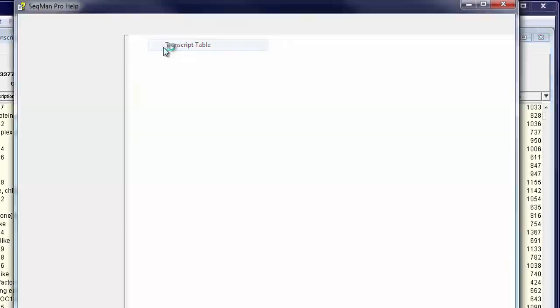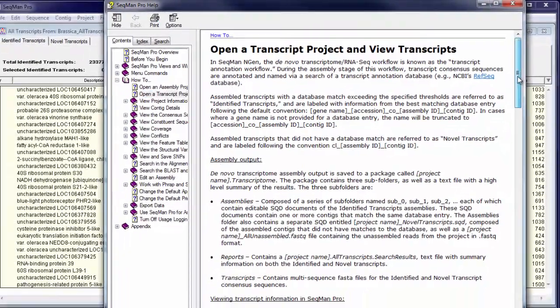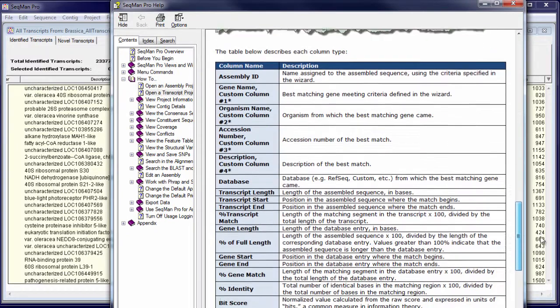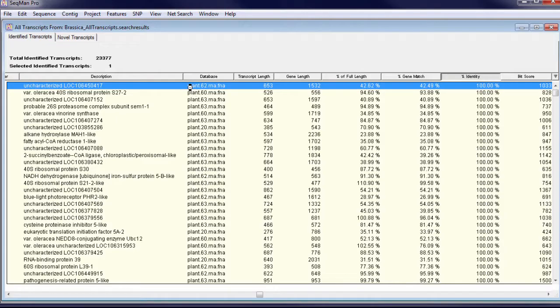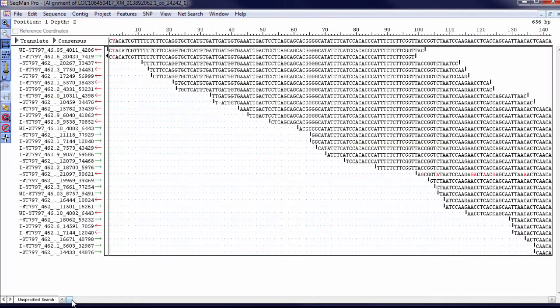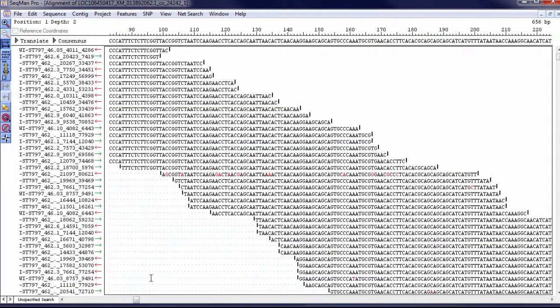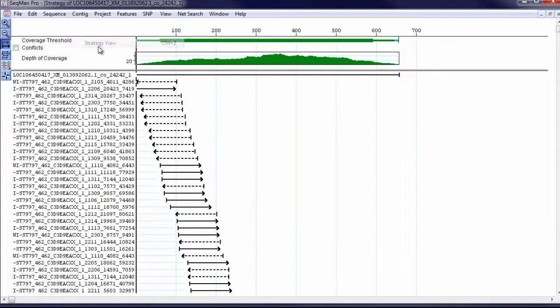Note that the help file provides detailed explanations for each column. Double-click on a transcript row to open the alignment of the assembled contig. From here, you can also open up the strategy view to see the assembly coverage.